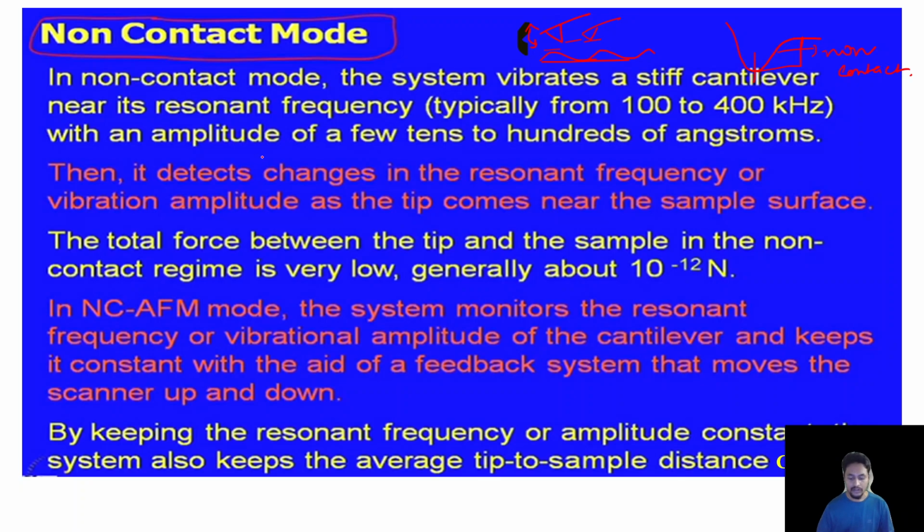But that is a similar kind of thing to contact mode. In case of contact mode, the tip is directly in contact with the surface. This is the tip, and at that time it is measuring the changes in the forces. Here it is just an indirect process of measuring the vibrational amplitude or the frequency changes depending upon the force. So these two are the same, but as there is a big gap between this tip and the surface, the resolution in non-contact mode is very weak, and normally imaging is never done in this non-contact mode.